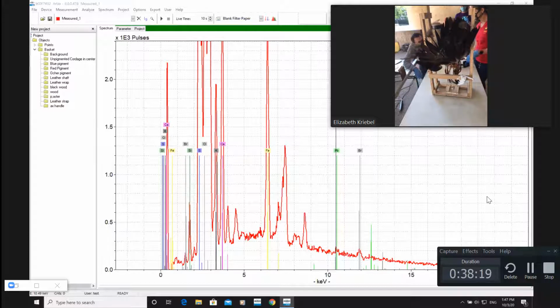That's interesting. So maybe this came out of a different collection that was not treated. Yeah, because I see bromine, and there's chlorine too, so there are definitely halides on it, which obviously are going to knock bacteria back on their feet. So this is salt washed. There's also just a phenomenal amount of sulfur, and I don't know if that's inherent to bird feathers. I've not measured eagle feathers before, but the sulfur is absolutely off the charts on this. But there is absolutely chlorine too. Interesting, and that was the felt? Sorry, that was the feathers. It could have been that they were washed in some kind of fat or oil to help them too.